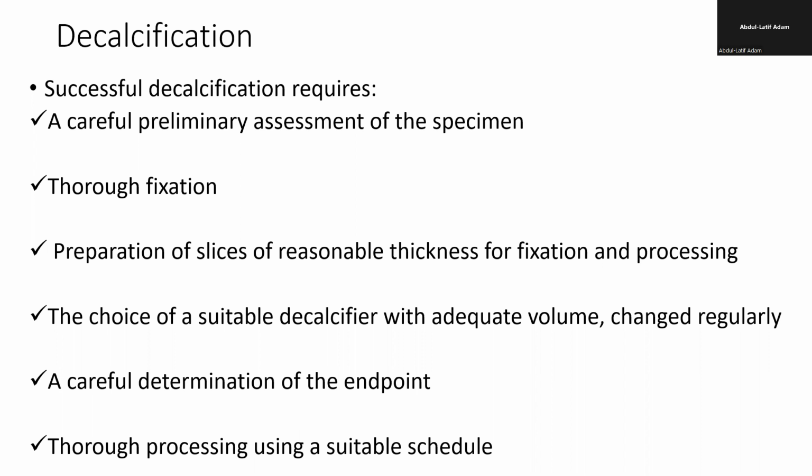Okay, so there are several ways of checking whether the tissue is being decalcified or not. We call it checking the endpoint of decalcification. So you put the tissue in the decalcifier. Definitely, when you remove the calcium, it will be in the solution. There are some tests that you use to check whether the calcium is being removed from the tissue and whether it has already been completely removed. With time, we change the solution so that it doesn't become saturated with calcium. If it becomes saturated with calcium, it will not be able to remove the calcium any longer. Okay.